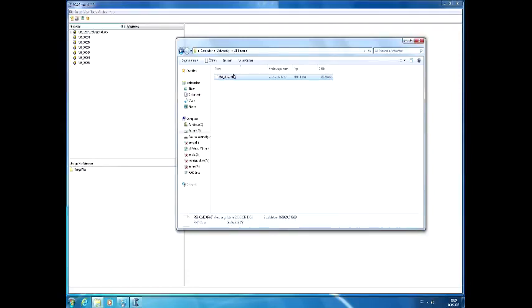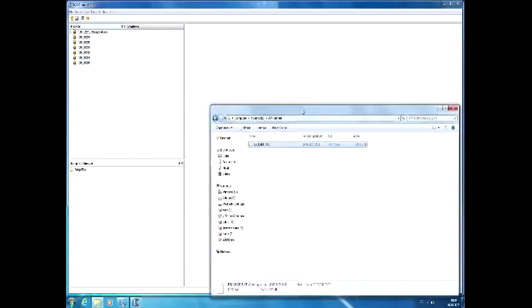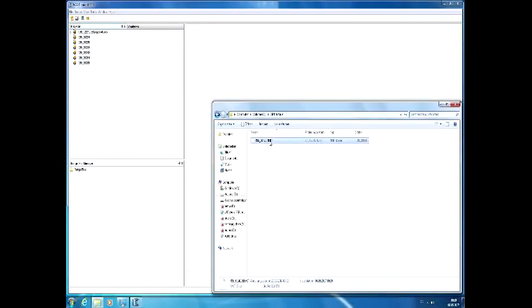I think you can change the name of the file and it will still retain all of that. I'm fairly sure it does, but we don't usually do that. We keep the raw run numbers. Main reason for that is that you can easily go back into the database, into the server, and look up old data. Because you might have written down, I've got R56 plus something. So R56 just stands for this is the 56th LEAP atom probe that's been built, and the rest is just a run number, and the information is contained in it.